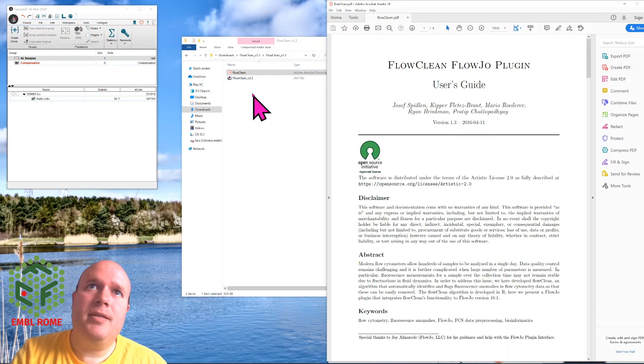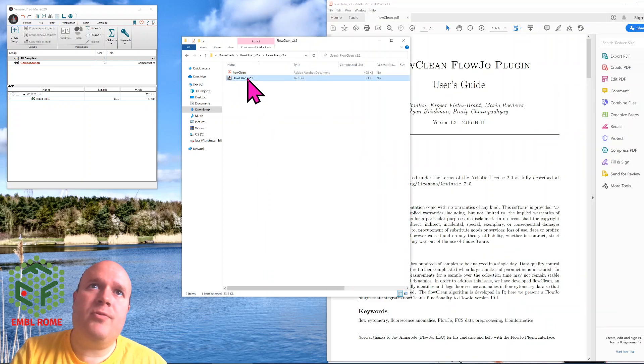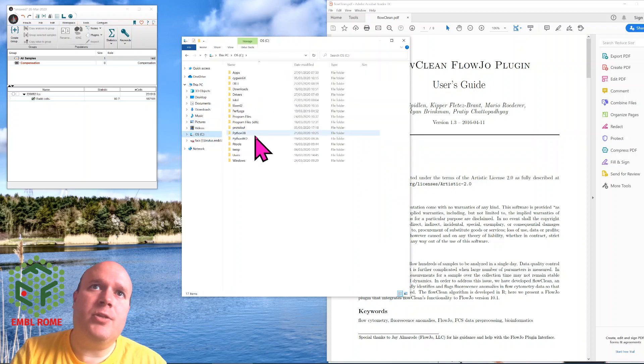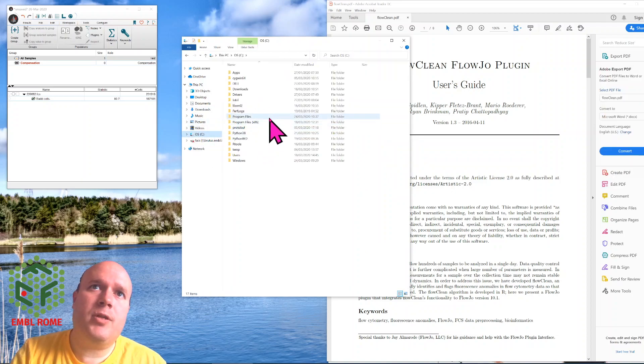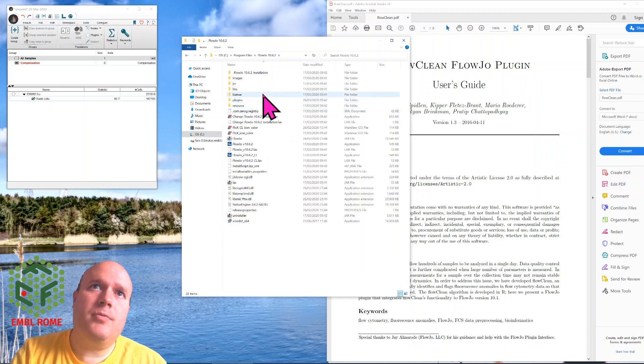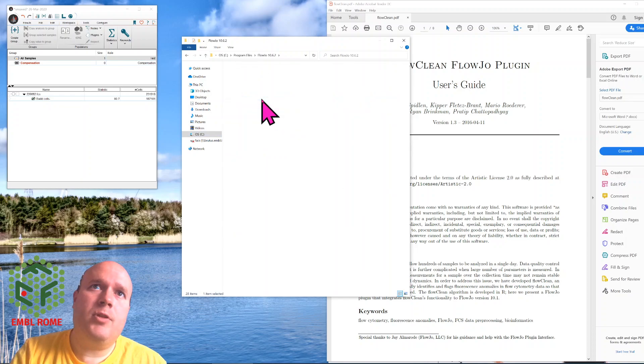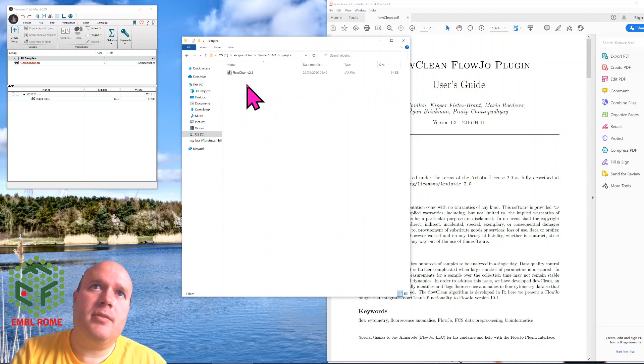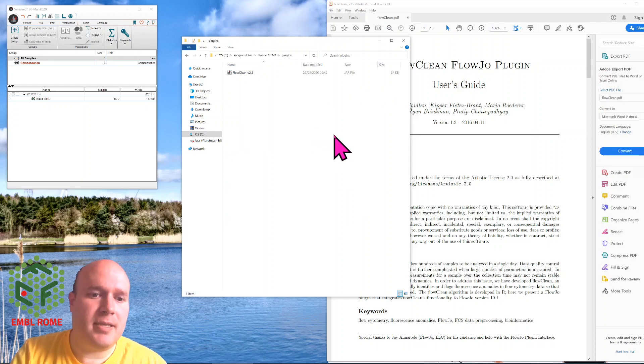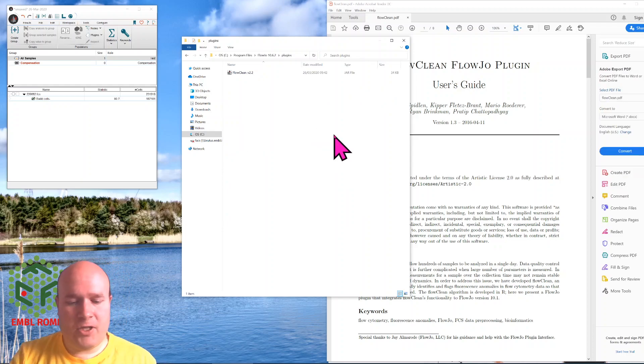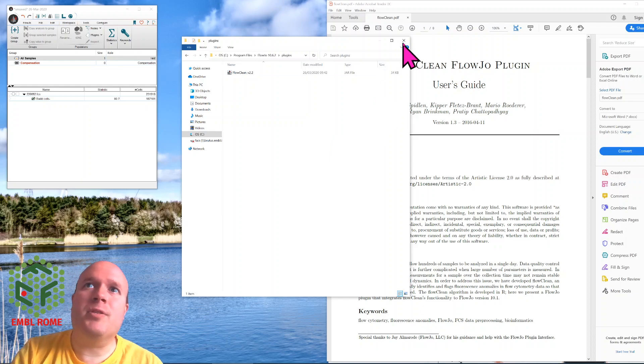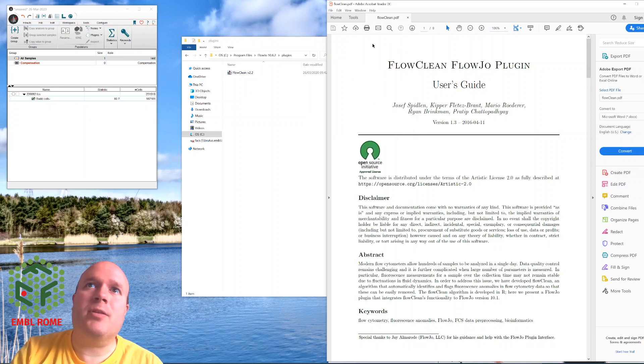We'll load the help file, and we'll copy FlowClean, and you want to put that into your FlowJo plugins folder, which is program files, FlowJo, plugins. I've already got one here, but you would paste here. If you're not an admin on Windows, you'll need to talk to your IT to have admin access to do this.